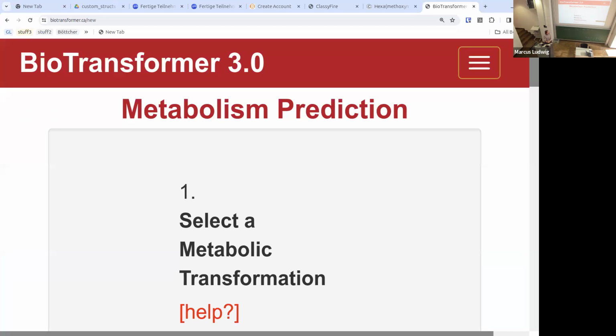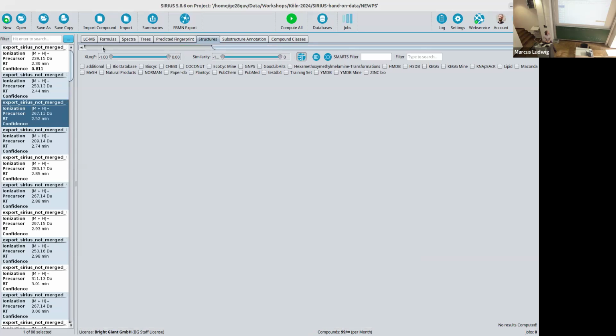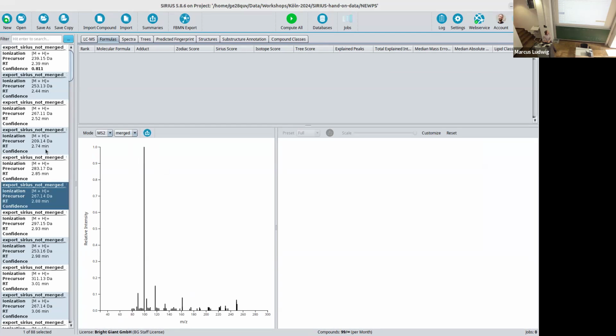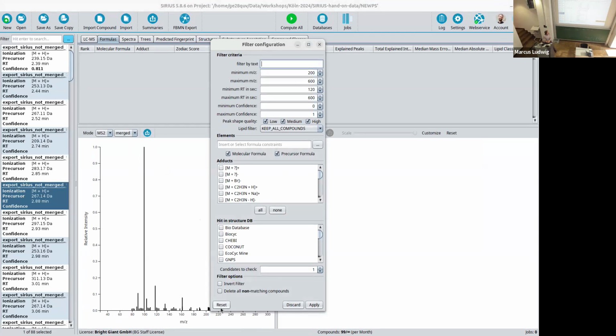So if you're basically referring to having like 5 different features in here, then no. So this is independent of this and of this, yeah. These are all completely independent of each other.